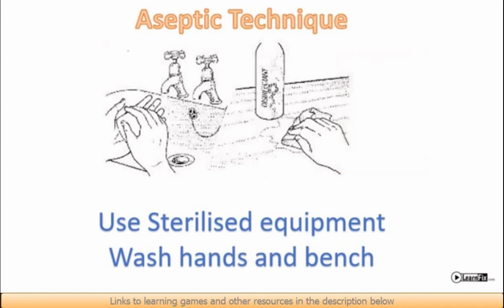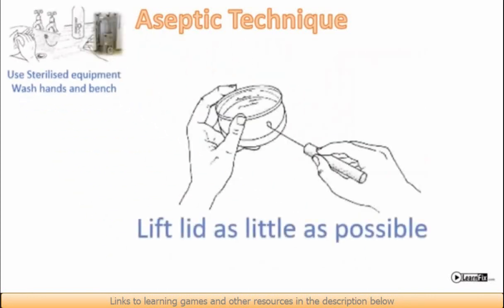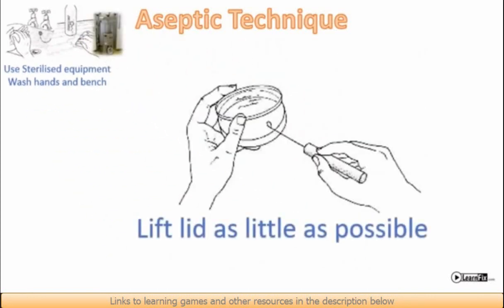When placing bacteria onto a culture medium, we need to expose the culture medium to the air and therefore airborne bacteria as little as possible. We do this by lifting the lid only a small amount and shielding the agar beneath it. We keep the lid over the base to act as a shield so that any fallen bacteria don't get onto the agar.